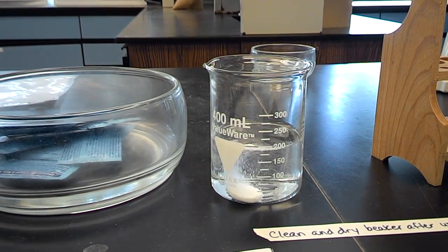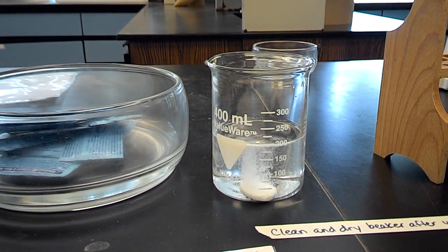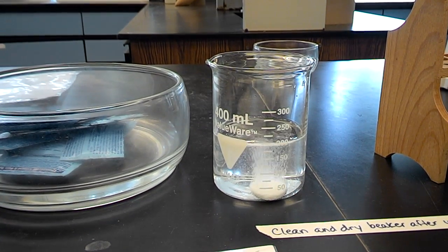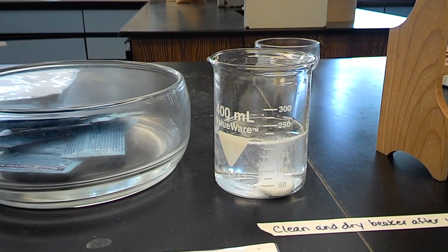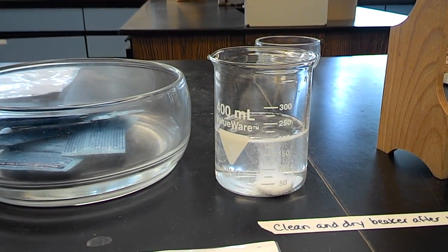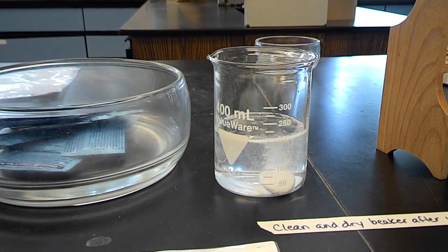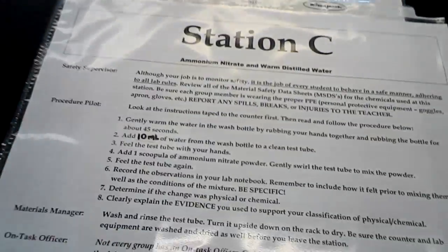If you'll notice, you took a liquid and a solid, and now you have bubbles, which indicates that there's a gas. So now you record your results, your observations, and determine if this is a physical or chemical change. Be sure to wash and dry the beaker when you leave the station. The next station is Station C.